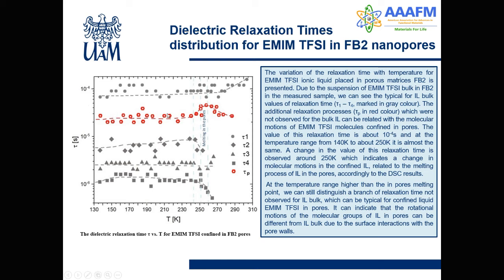This relaxation time can be related with the substances in confinement in pores, and it has a different value because of the interaction of the pore walls with the ionic liquid molecules.